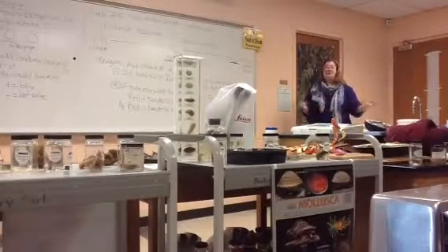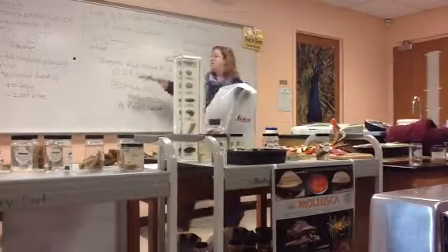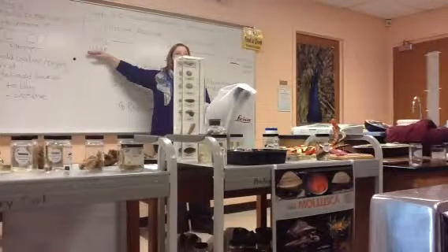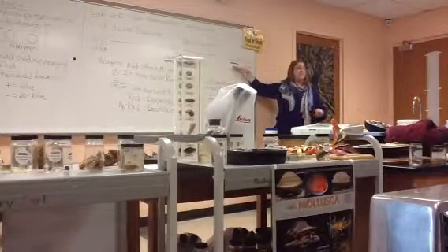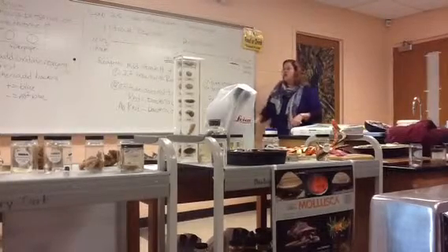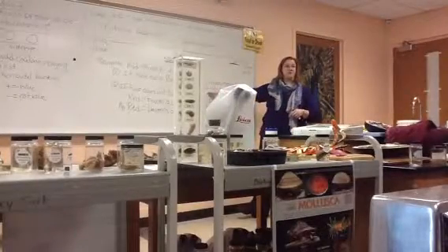Now, if the tube doesn't turn red after adding nitrate A and nitrate B, there could be two reasons for that. The bacteria could have stayed right here and did absolutely nothing, didn't do either one, or the bacteria could have gone all the way down to here and done both processes. We need to figure out which one it is. Did they do both or did they do nothing? So we're going to add two more chemicals, only to the tubes that didn't turn red the first time, because we know the answer for those tubes.